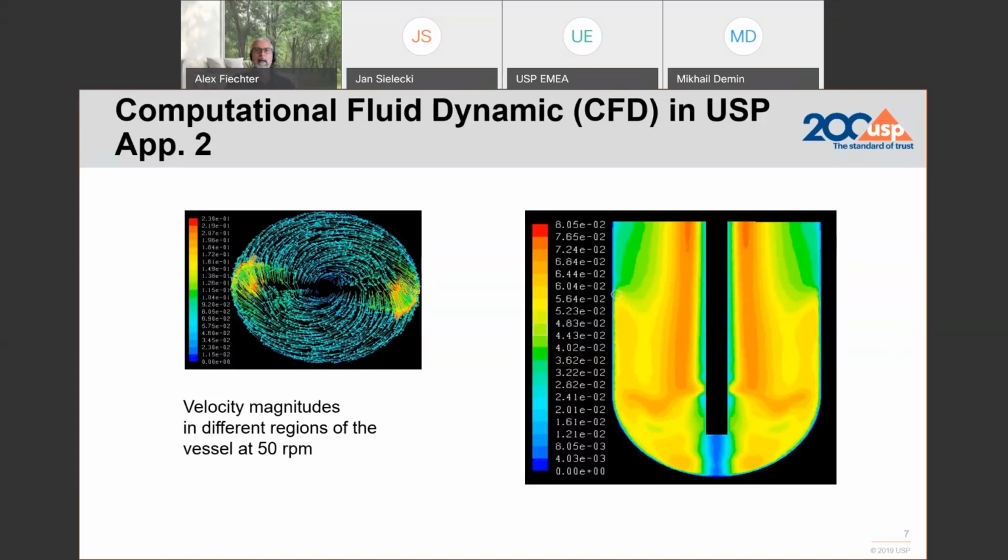So not only for the agitation here, but also considering when you take the sample, it is actually meant on purpose that you have to take a sample, as described in the general chapter 711, in the zone midway between the media surface and the paddle top or the basket top, at least 1 centimeter from the vessel wall.